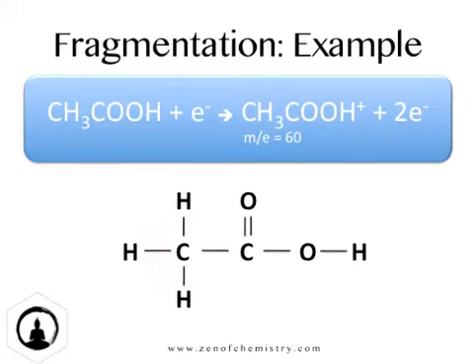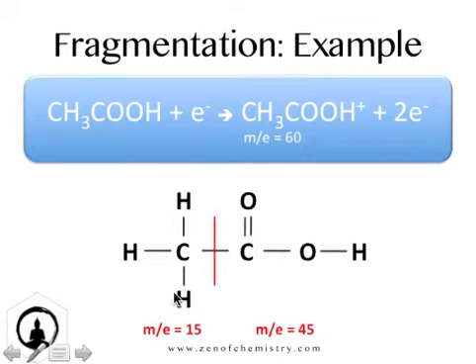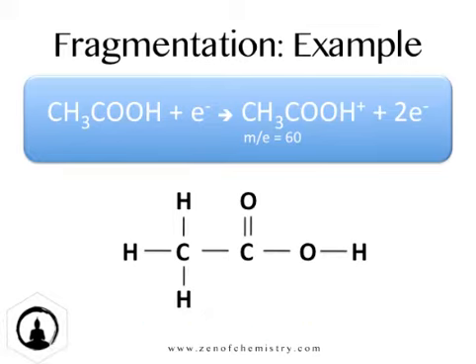The molecule could also break, say, here, giving us a peak of 15. 12 plus 1 plus 1 plus 1 is 15. And then the rest of that molecule is 45. The molecule could also break here, which gives us two fragments, one of 43 and one of 17. It can also break at other points, but I'm just going to use those as examples.